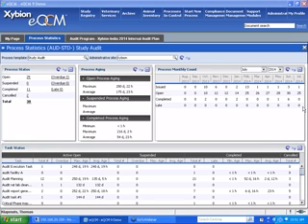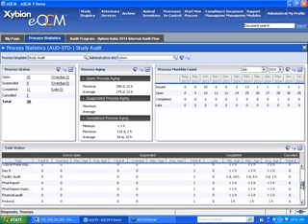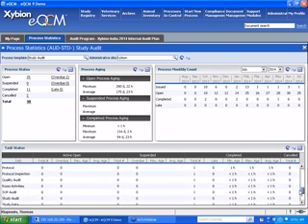And then you can also look at the bottom and look at each one. So you can sort them by maximum age, minimum age, so which ones are the oldest, and you can follow up and get those completed. It has all the information, if they're overdue, if they're late. Again, as you define that metadata within the audit, putting in a due date, putting in an estimated duration, the system will keep track of all of that information and provide it to you in this table.